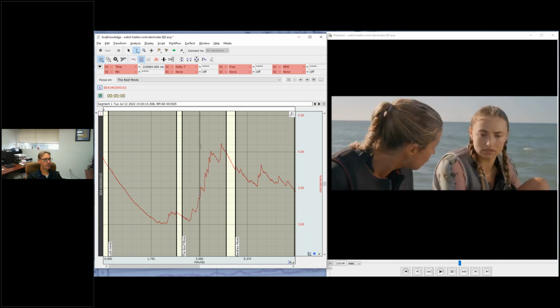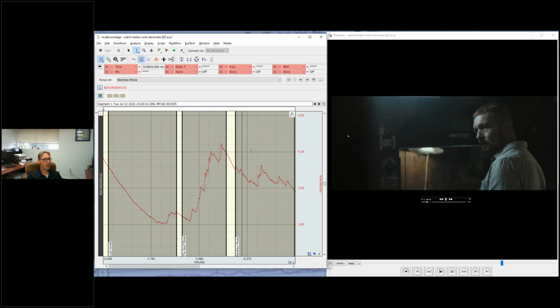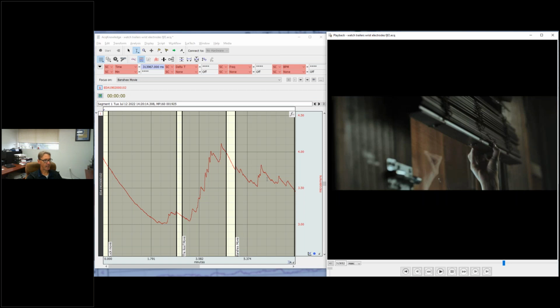So if I click into any of these, I can play through the video, I can play it back and see exactly what the person was looking at as they were responding to that part of the movie. So it's time synchronized movie trailer to the actual signal itself.